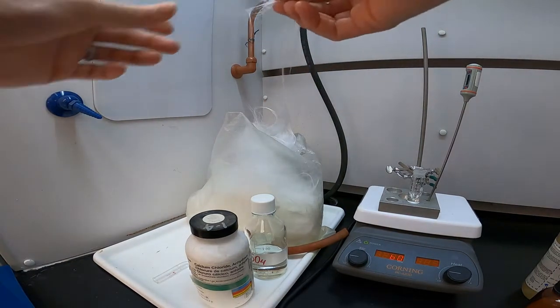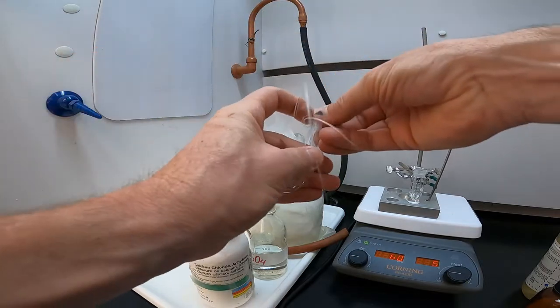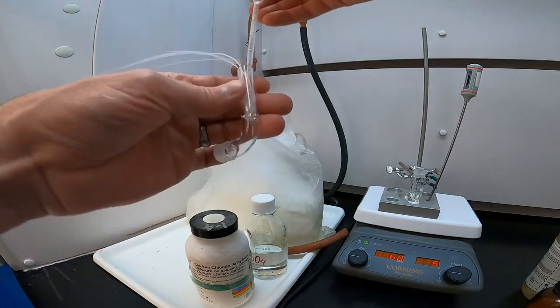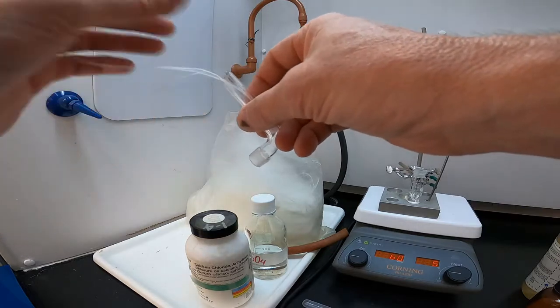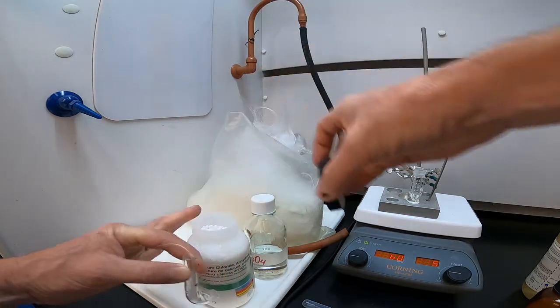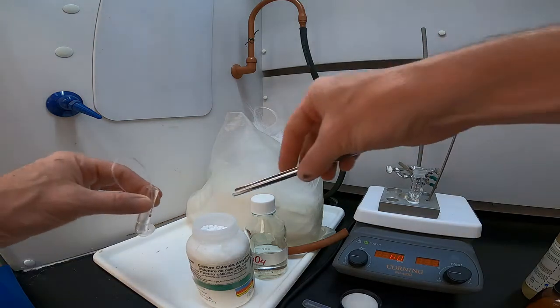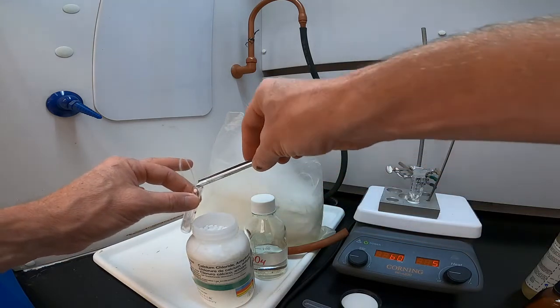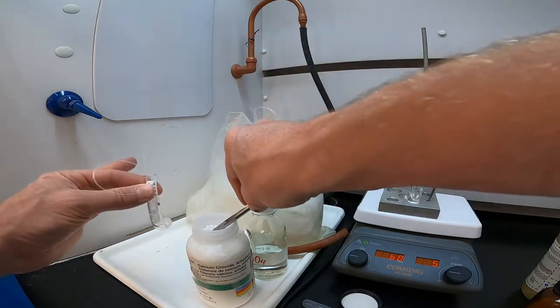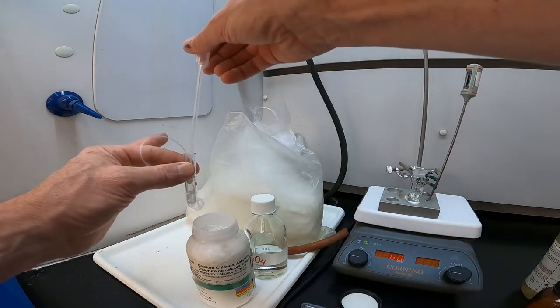We just put a little bit of glass wool for starters in one end of the tube. Doesn't really matter how much, just enough to be in there to hold the calcium chloride in place. And to get the calcium chloride in there, I'll use a little scoop. All this, the calcium chloride, is a drying agent that absorbs moisture from the air. And it also would absorb moisture that's created in the reaction, so it doesn't return back to the reaction.